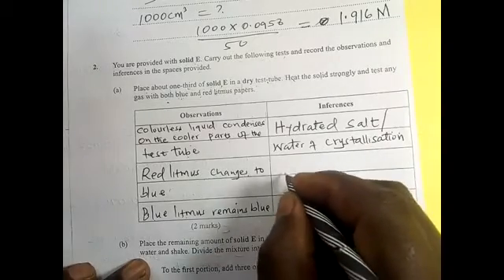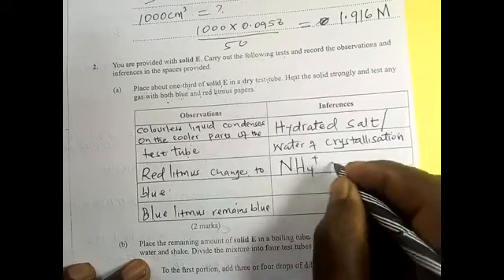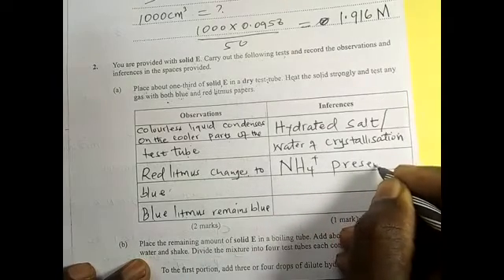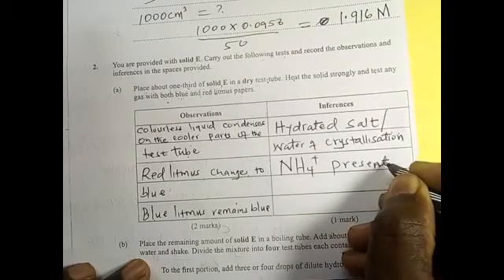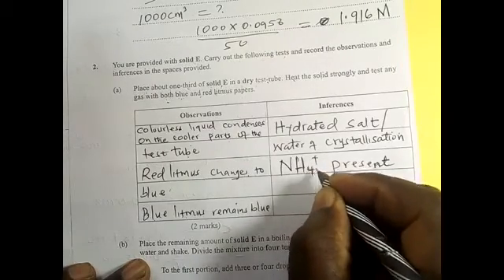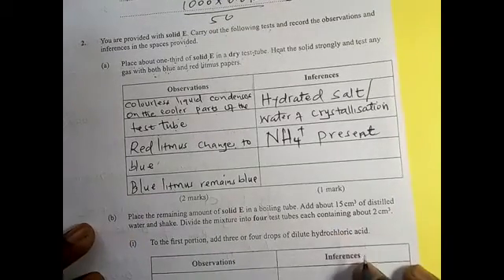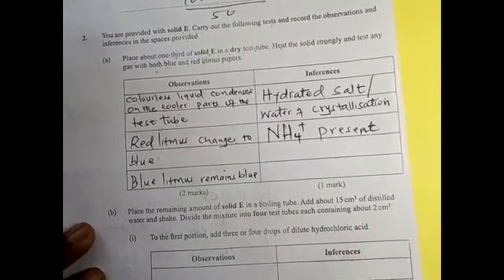So there you write that ammonium ion is present. Remember, ammonia is the only gas that is basic, so we use ammonium ion present to imply that the gas that was produced is a base.